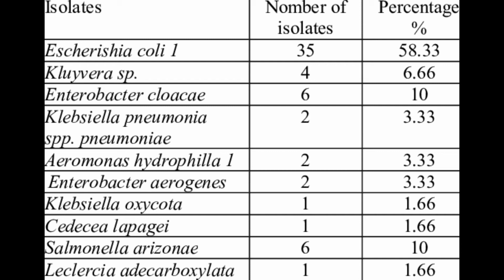Now let's start with the phenylalanine deaminase test, which deaminates phenylalanine to phenylpyruvic acid. The medium is a phenylalanine agar slant, and the reagent is 5 drops of ferric chloride. The positive result is a green slant, seen with Proteus, Morganella, and Providencia. Using a wire loop or needle, do simple streaking across the slant, then incubate. A positive is a green slant, while a negative shows no green slant formation. There is a yellow color on the slant because of the dark yellow color of the ferric chloride.